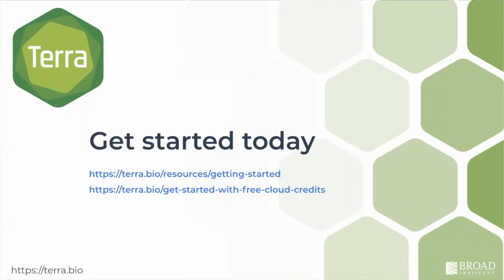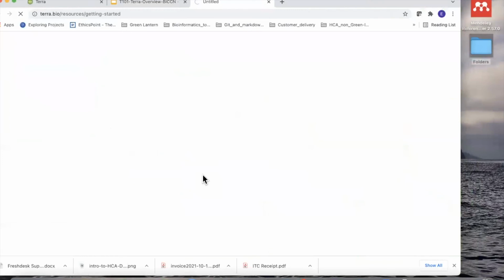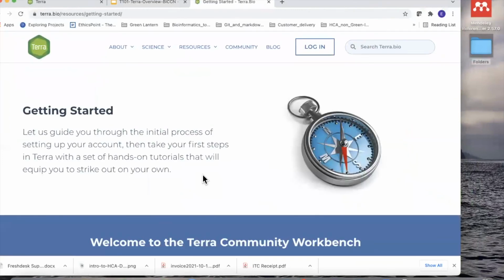Okay, so before I kick off our live demo of the platform and our hands-on activities, I'm just going to navigate to this resource here, this Getting Started link. This is going to take me to terra.bio. I wanted to highlight this resource because there's a lot of very helpful information on this page.